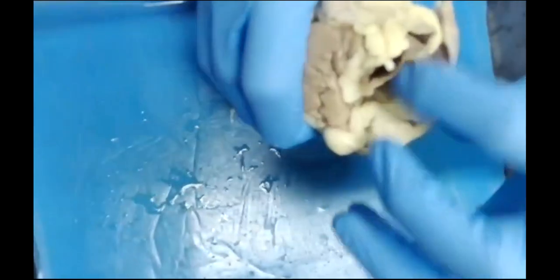So we can see some of these vessels. Just understand that it's kind of been torqued and twisted a little bit, where it's not quite looking as perfect as it should. Now we can actually squeeze it and press and try to get it to reorient a little bit, which is what I'm trying to do here.